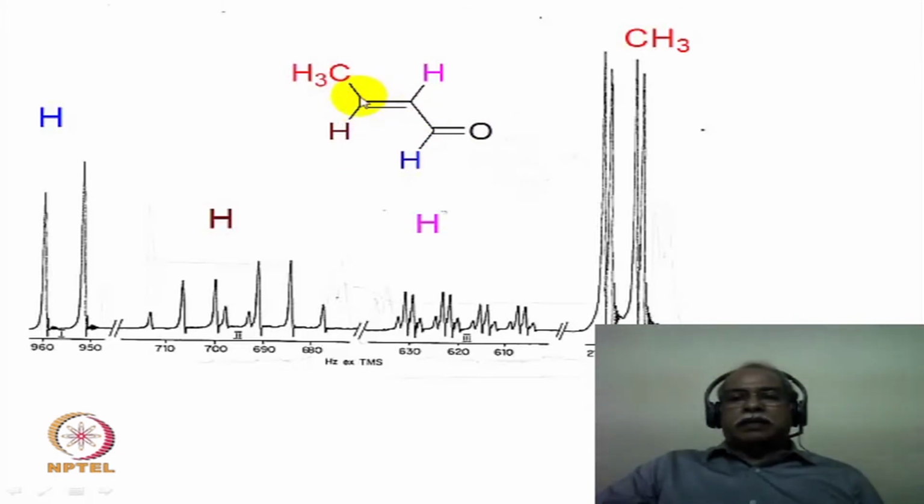The beta carbon is always an electron-deficient carbon in an alpha-beta unsaturated system. So the electron-deficient carbon bearing the hydrogen will have less electron density. So between these two hydrogens, this will have a higher delta value compared to this particular hydrogen. The higher delta value comes around 7.7 ppm or so in terms of the chemical shift value. What would be the multiplicity of this hydrogen?